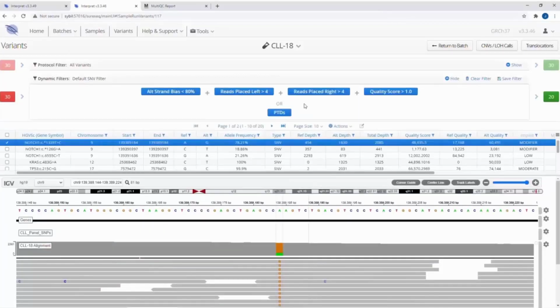We applied the filter, this was the filter we've just applied, and we ended up with 20. So we can zoom in on our variants of interest. And of course, to zoom in on variants of interest, we can customize our columns, and we can see here that in addition to the attributes of the variants, there are a multitude of entries related to the pathogenicity of the variant.